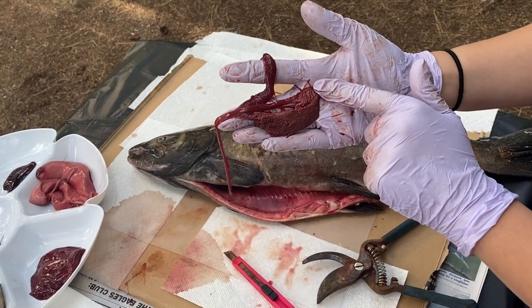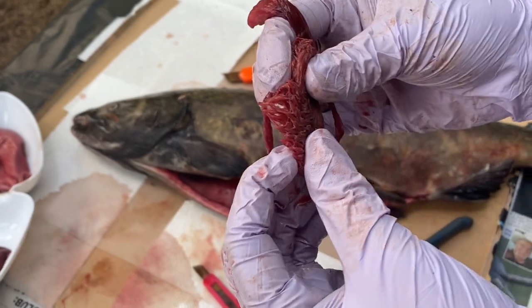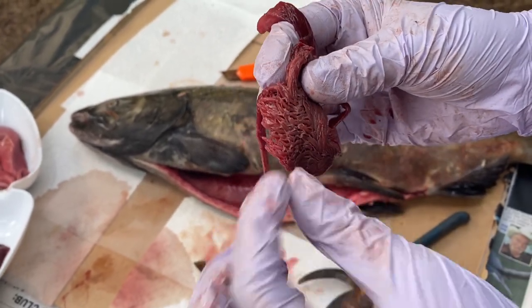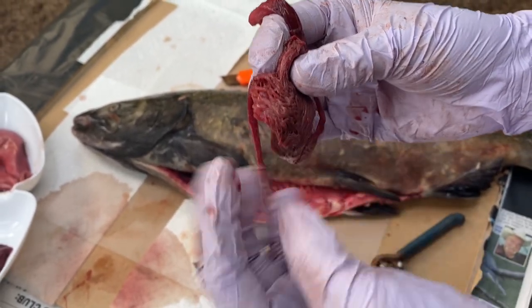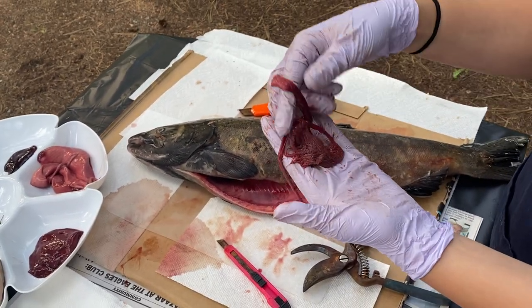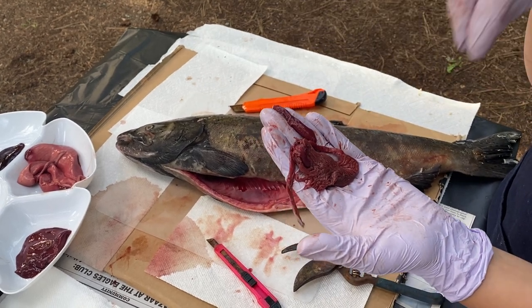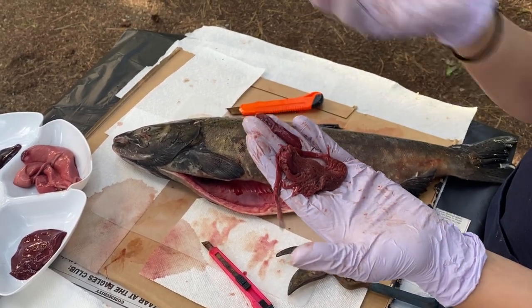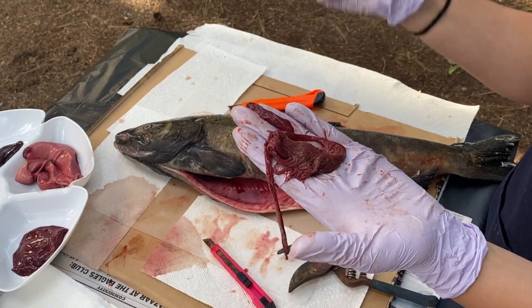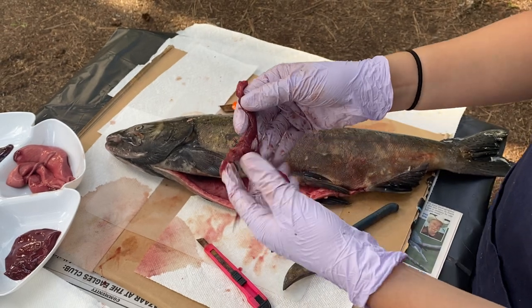And then after its stomach, it has this guy right here, and it has a whole bunch of little fingers, kind of like those gills almost, and it looks kind of like a net. It's called the pyloric ceca. Humans do not have a pyloric ceca, but what it does is excrete an enzyme that helps break down food, kind of like what our stomach acid does, right? Stomach acid breaks down the food and pulls the nutrients out. This is what's going to break down that food for the salmon.